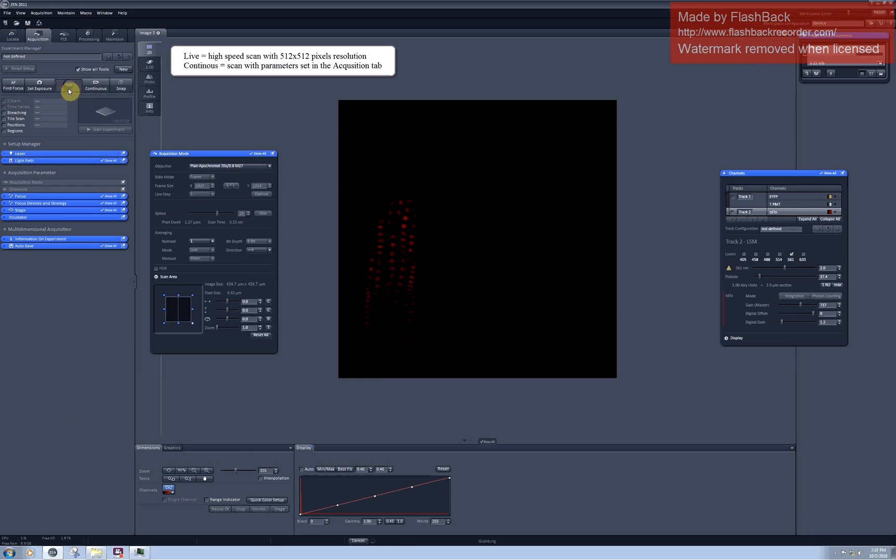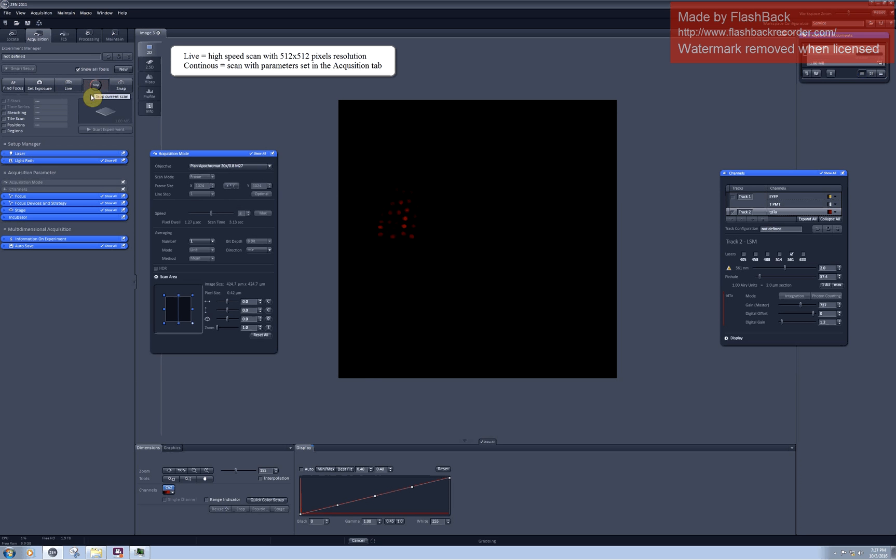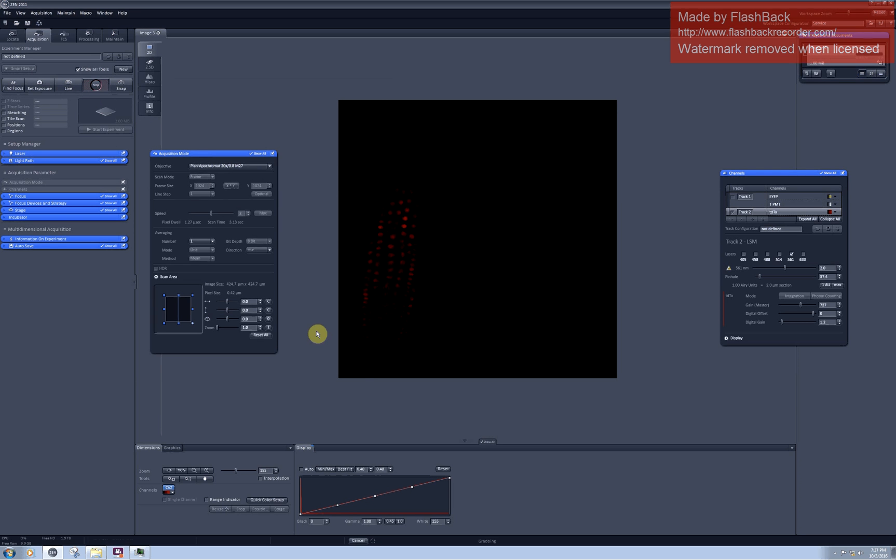So if I set up the resolution on 1024 I will see absolutely no difference in the fast scan, but in the continuous scan the scanning will be slower and higher resolution.